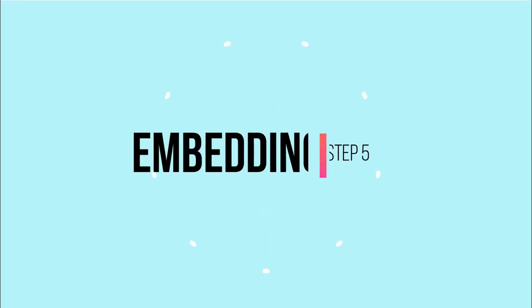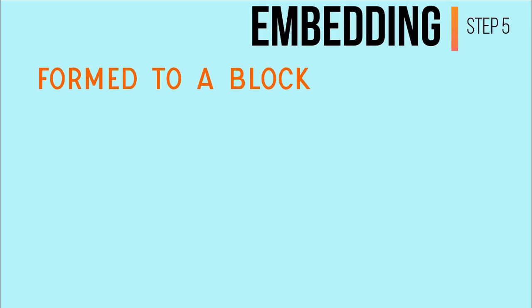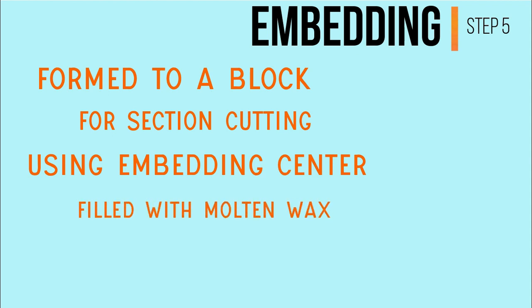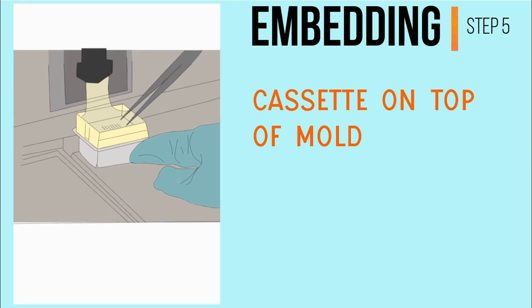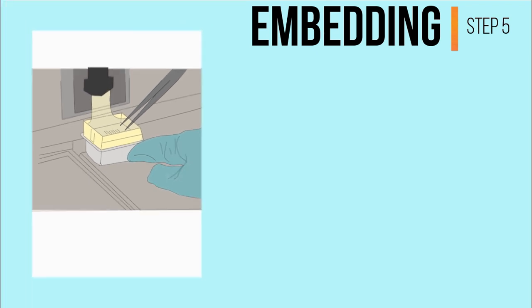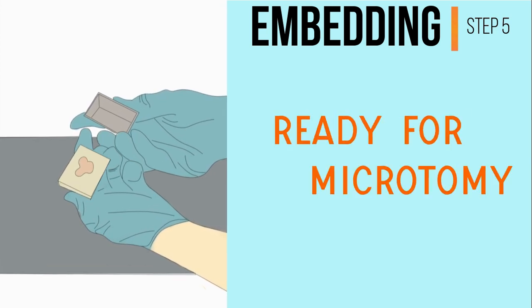Now that the specimen is thoroughly infiltrated with wax, it must be formed into a block which can be clamped into a microtome for section cutting. This step is carried out using an embedding center where a mold is filled with molten wax and the specimen placed into it. The specimen is very carefully oriented in the mold because its placement will determine the plane of section. A cassette is placed on top of the mold, topped up with more wax, and the whole thing is placed on a cold plate to solidify. When this is completed, the block with its attached cassette can be removed from the mold and is ready for microtomy.